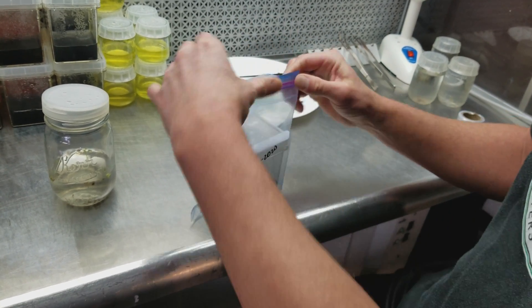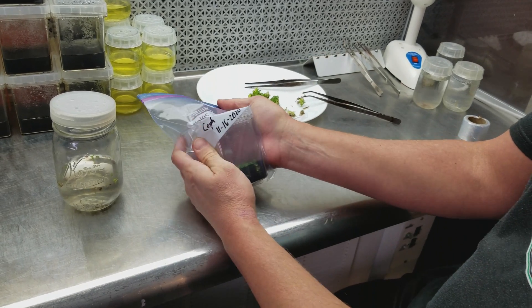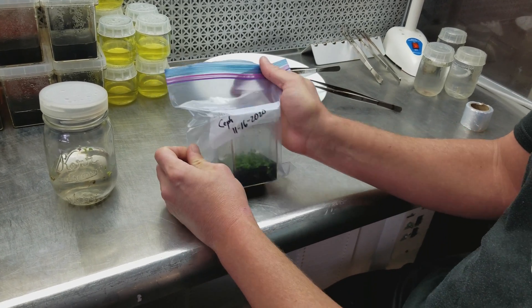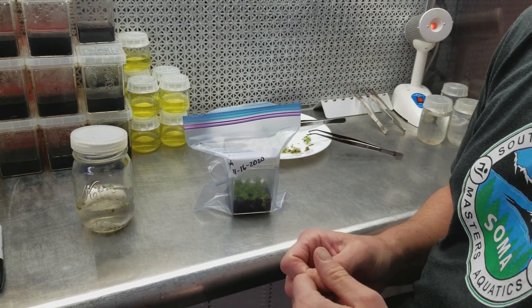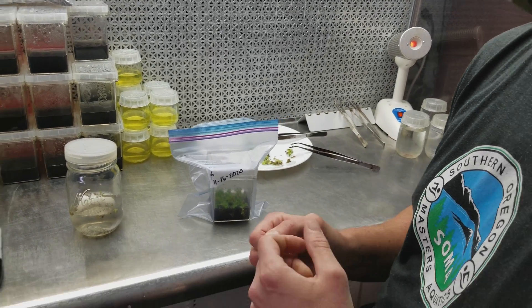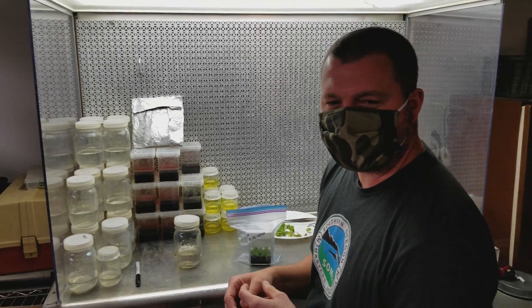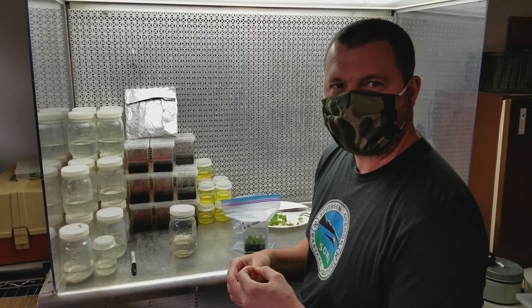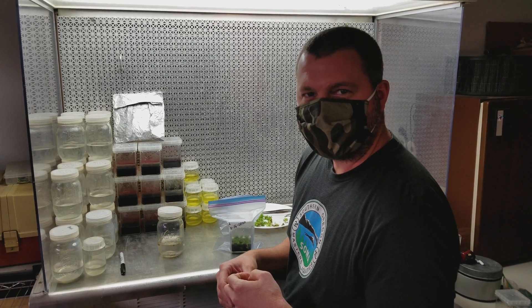These plants will grow out and then I'll either replate them again or put them into soil — probably some of each. I try to keep enough cultures going that I can keep rolling them out but also keep some in tissue culture so I can make more if needed. When I pot them out, we use premium New Zealand long fiber sphagnum moss, which supposedly has antibacterial properties — so that helps even more. That's a little bit of what I do every day — hours and hours of this kind of work during the winter, getting ready for plant demand in the spring and summer. Thanks for listening, Flytrap and carnivorous plant acolytes — bye for now!